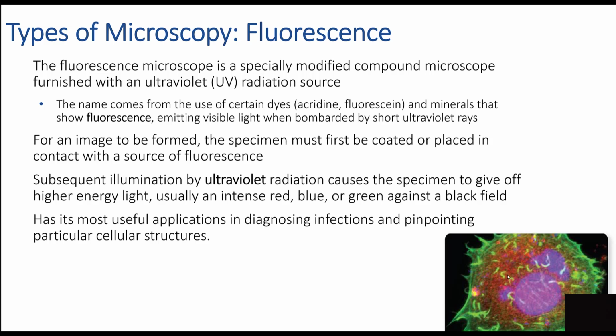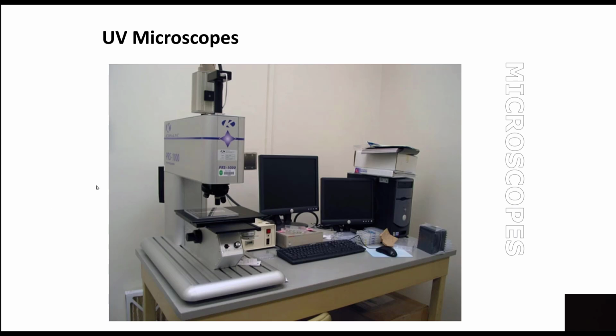So we can have antibodies attached to a particular fluorescent stain or dye, and then apply that, and so the antibody will stick to wherever it needs to, that it is raised against, and carrying with it is a little fluorescein type of fluorescent stain, and then use UV, and boom, you can make some really positive differential diagnosis with that.